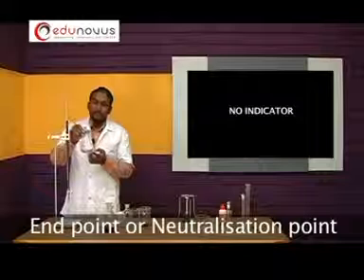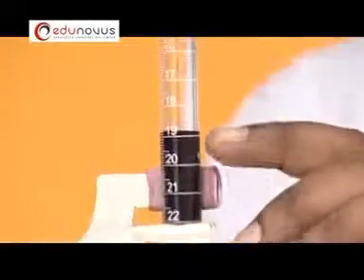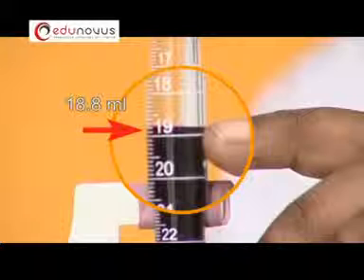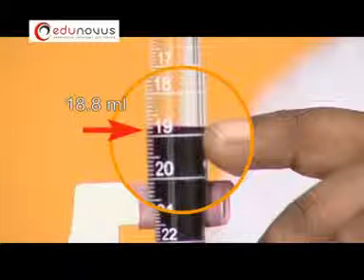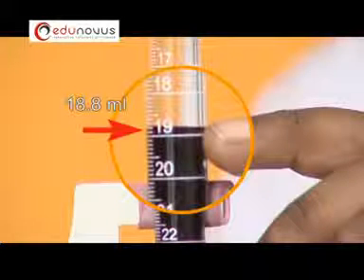Here the colorless solution turned into pale pink. This is called the endpoint. Now, note down the readings from the burette. The burette reading is 18.8. As it is a colorful solution, the upper meniscus of the solution should be taken for the reading. The upper meniscus coincides with 18.8. Therefore, the reading is 18.8.